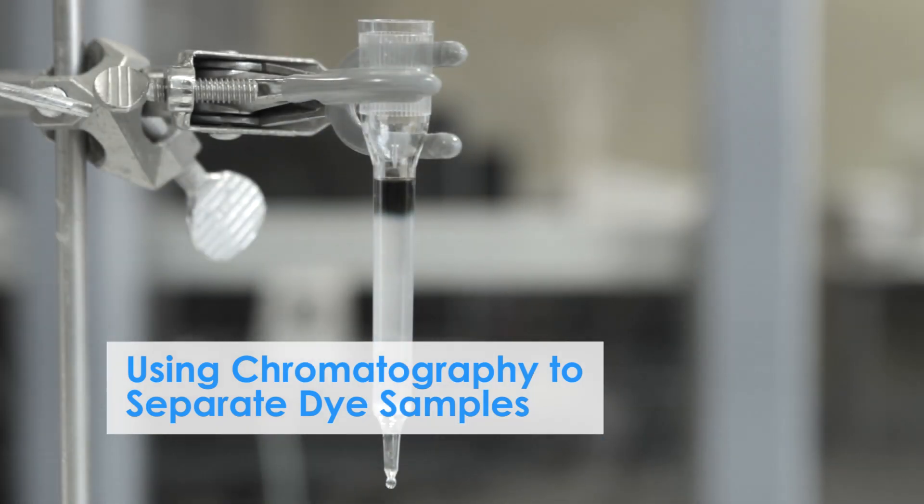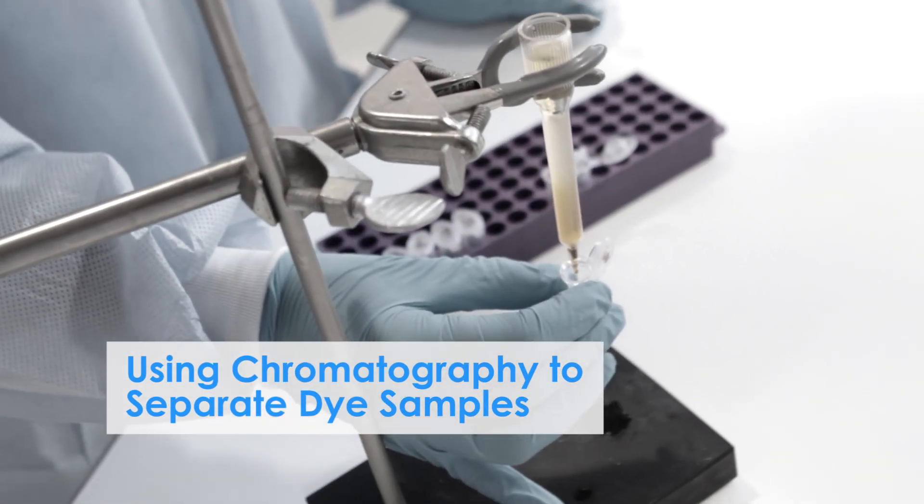Step 7: Proceed to the next module using chromatography to separate dye samples. If time is limited, the experiment can be temporarily stopped after the column has been packed.